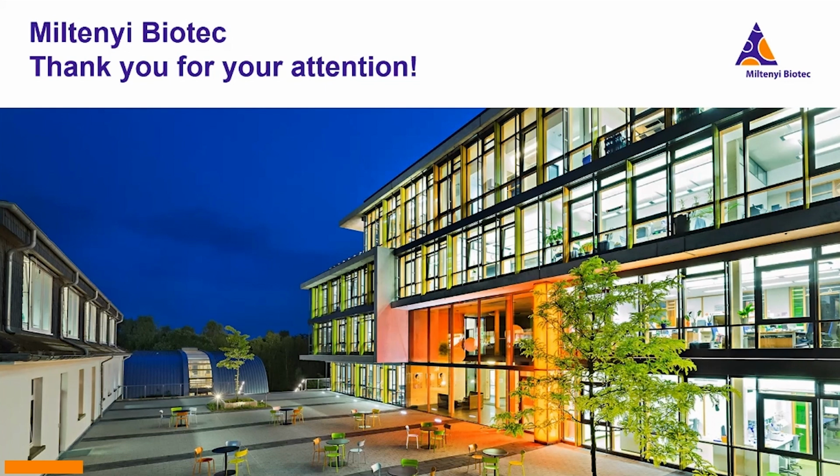Okay, yeah, there's another FFPE tissue dissociation kit, so don't confuse them. The one which is already at the market, there we are aiming to isolate cells, and there is also the possibility, this is also including an antigen retrieval step. So this is not optimized for downstream NGS applications, so really pay attention if you're looking on our website that you get the right kit for the right application.